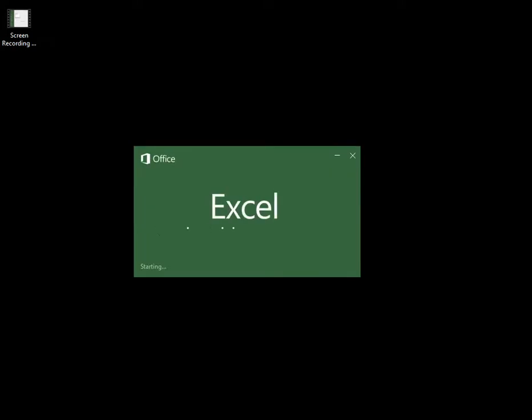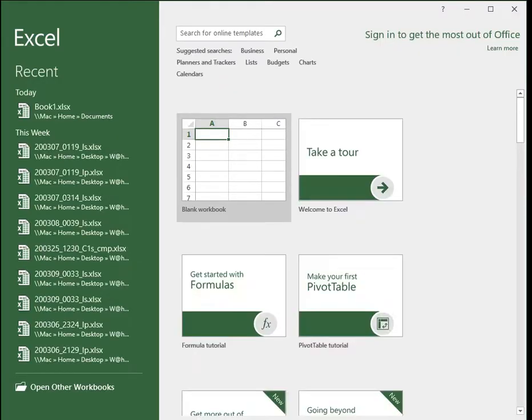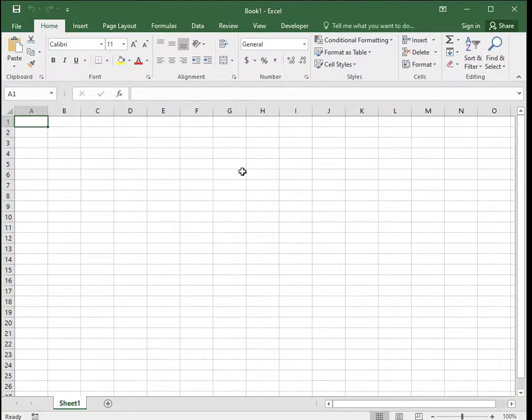Excel XPS and XAS simulation tutorials. This is a brief introduction of the Excel macro program for XPS and XAS spectral simulation. Excel is available on almost every computer, and the beamline developed the macro program for users to analyze the data and even to simulate it.